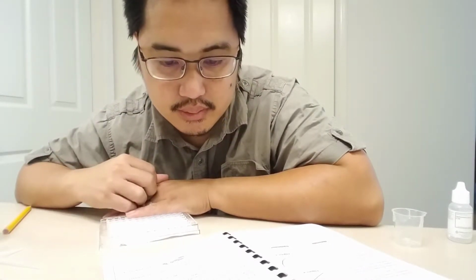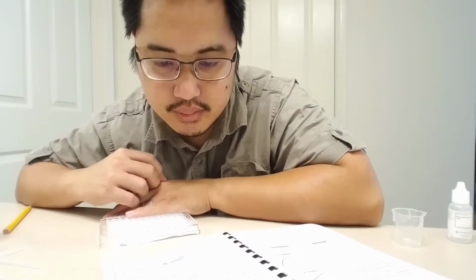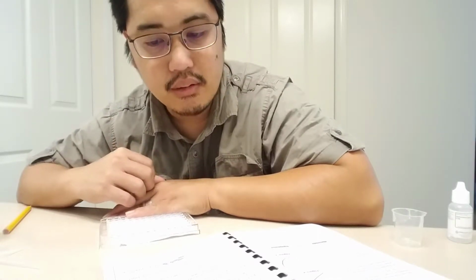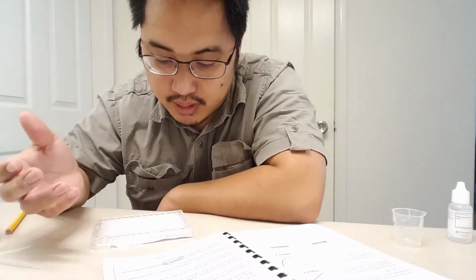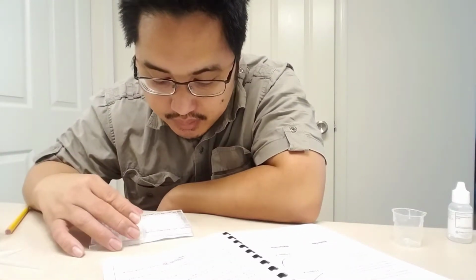Did I do this wrong? Let's see. Oh, I did this a little bit wrong. I apologize. Apparently, you start with 5 drops in A1, then 4 drops in A2, then 3 drops in A3, and then 2 drops in A4, but you don't need to go to A5. Apparently I set up one extra experiment for myself. I apologize.